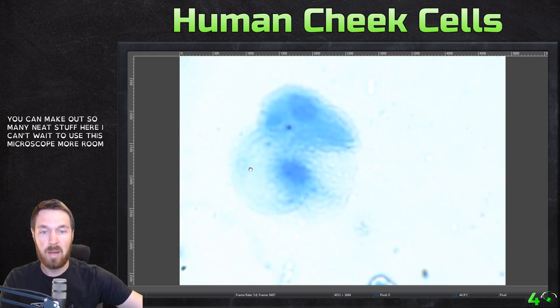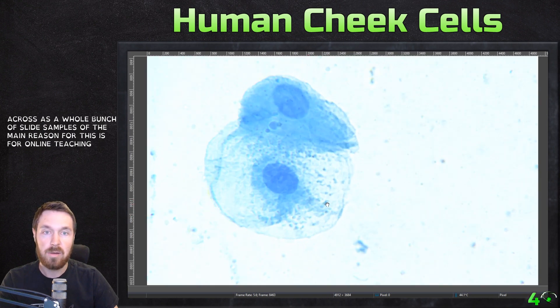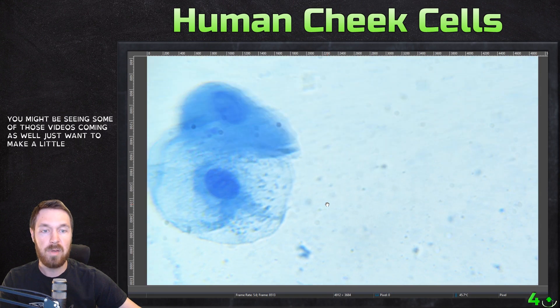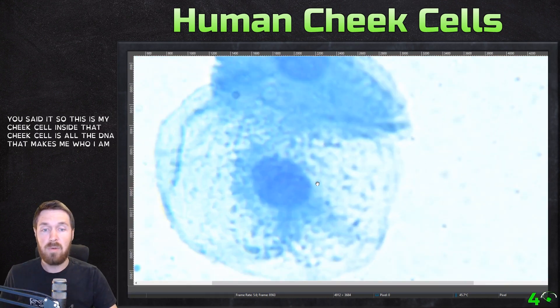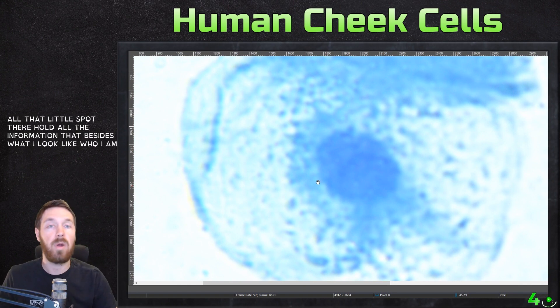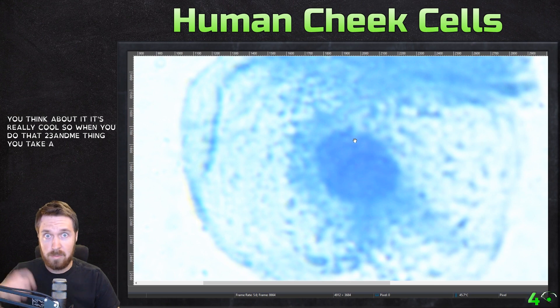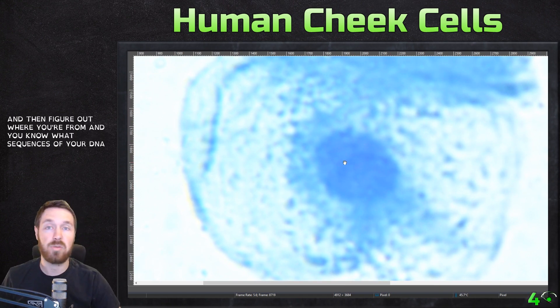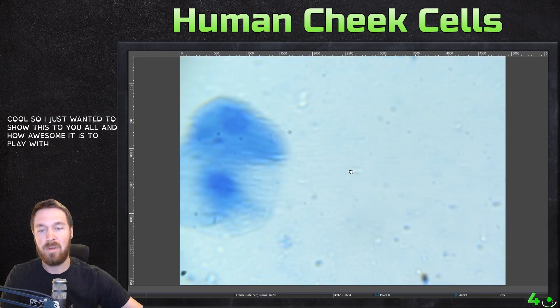I can't wait to use this microscope more. We're going to be looking at pond water, probably insects, all sorts of stuff. I have a whole bunch of slide samples. The main reason for this is for online teaching — anatomy and physiology and histology of different tissue types. So you might be seeing some of those videos coming as well. This is my cheek cell, and inside it is all the DNA that makes me who I am — what I look like, who I am, and what I could pass to my offspring. When you do that 23andMe thing, you take a spit sample or cheek cell swab — you're sending them this — and it can figure out where you're from and what sequences of your DNA match with other areas of the world. Super cool.